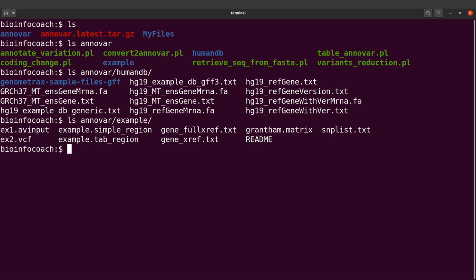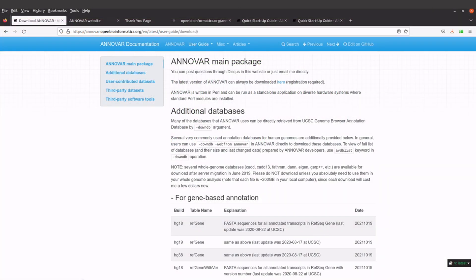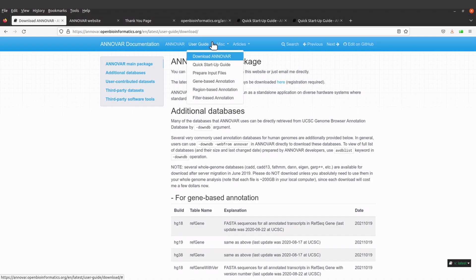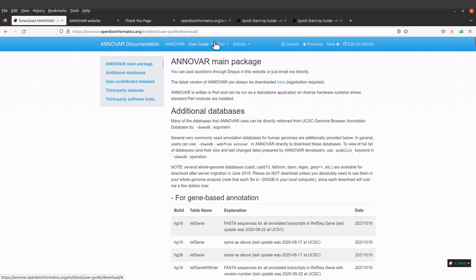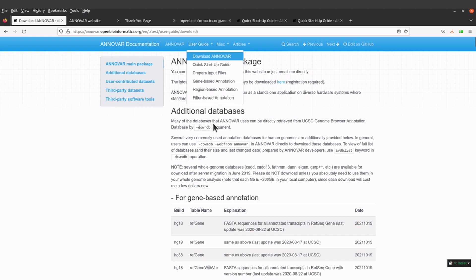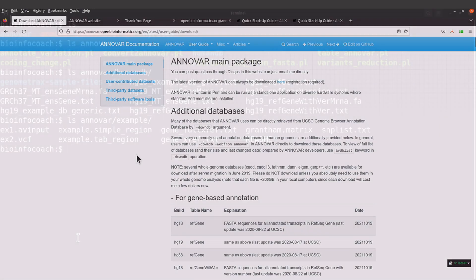It is important to note that in ANOVA there are three types of annotation. On the ANOVA software page, go to User Guide and click it to find the dropdown. The last three options are the main annotation types: gene-based annotation, region-based annotation, and filter-based annotation. For this tutorial I will demonstrate by running an example command that will perform a gene-based annotation.